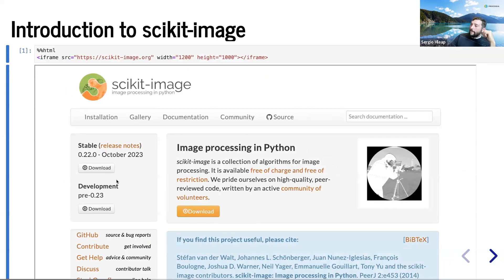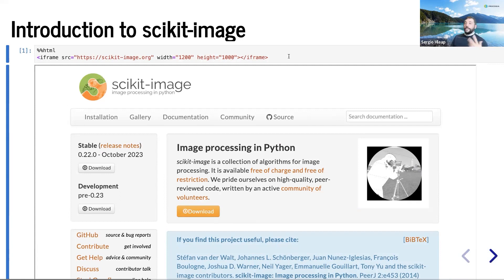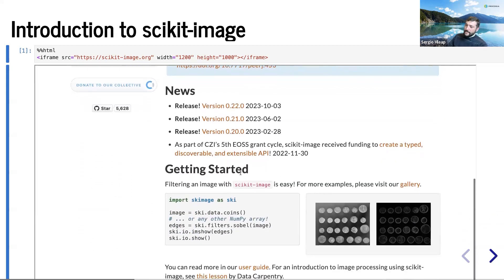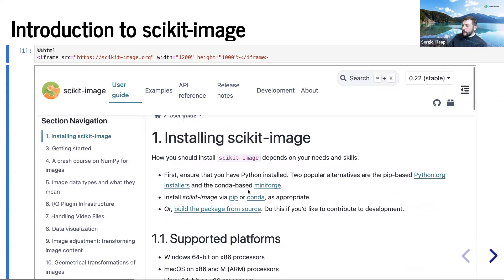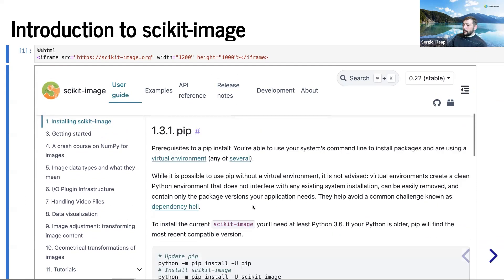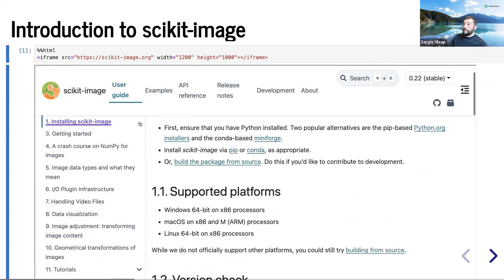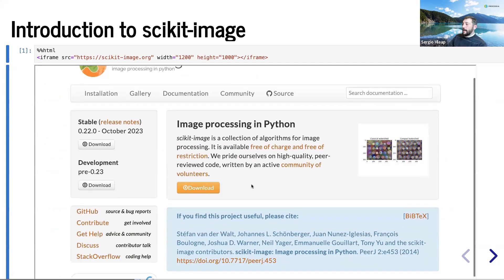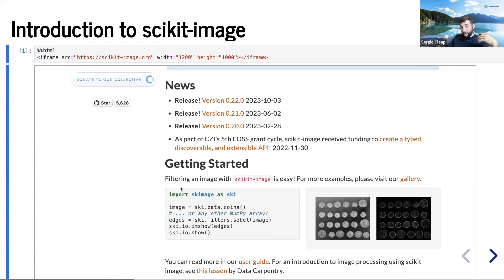There are multiple libraries available for image processing in Python. The easiest one, in my opinion, is scikit-image, though it's not the most efficient. There are significantly more efficient libraries like OpenCV, but the syntax is more complex. You can find scikit-image at scikit-image.org, and install it using pip or conda: 'pip install scikit-image'. When you import things into Python — which is something we didn't cover in the basics section — you'll need to import these libraries at the top of your script.